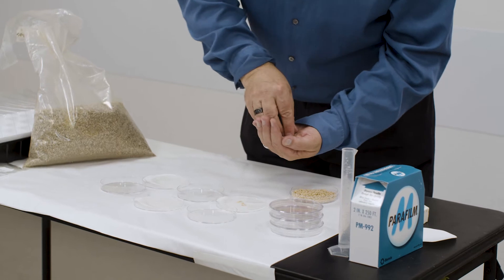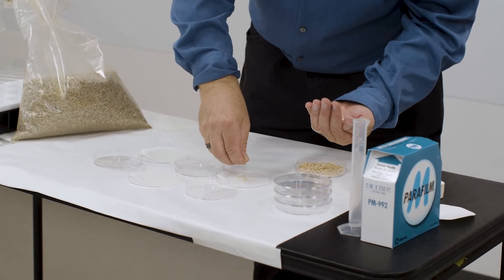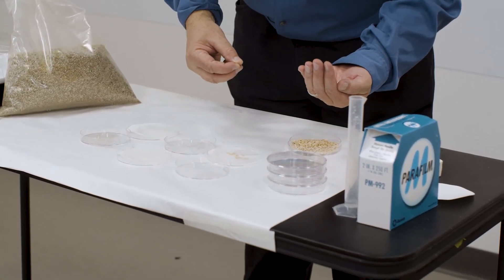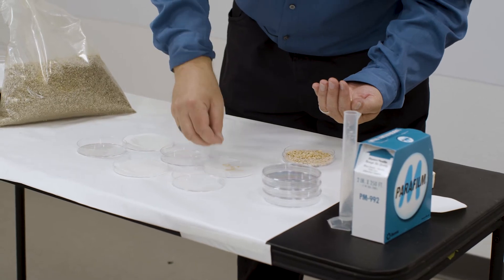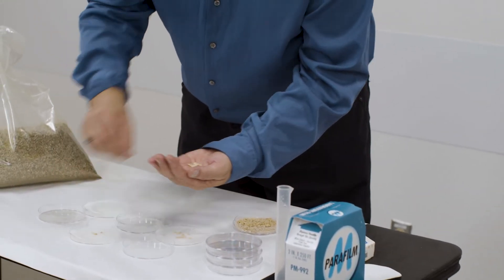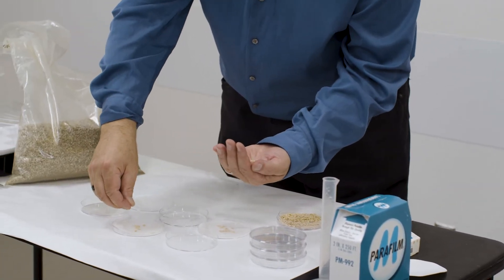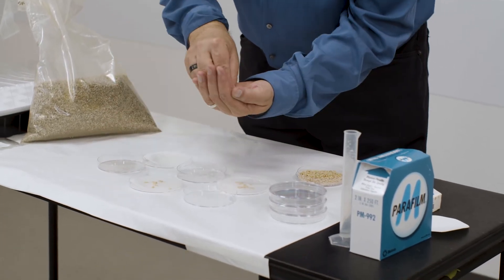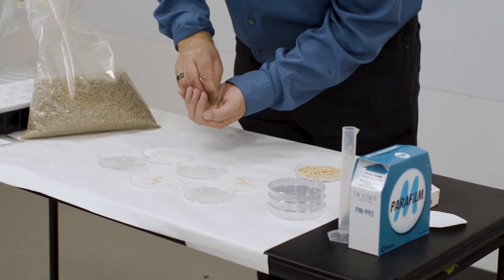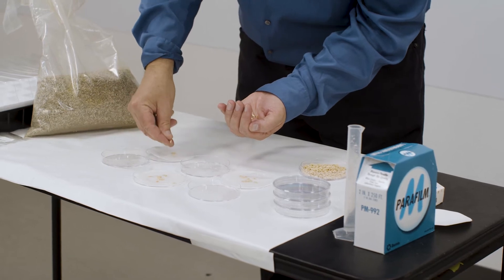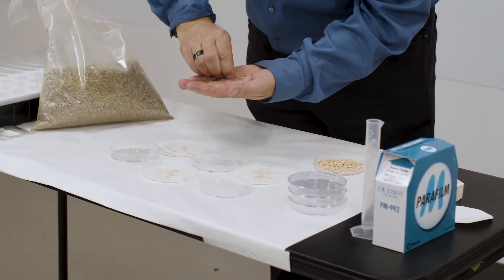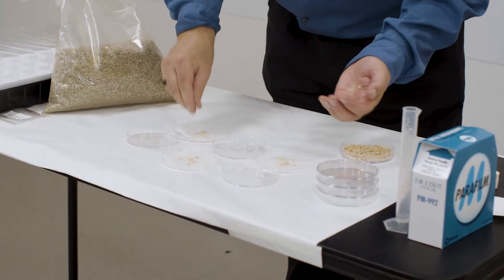So what we're going to do, I'm going to put, I like numbers that make the math easier. So I'm going to put 10 seeds in each of these petri dishes. Let's get the third one.